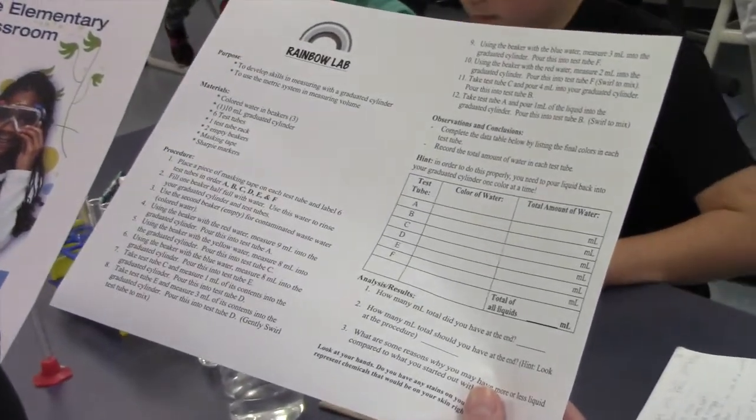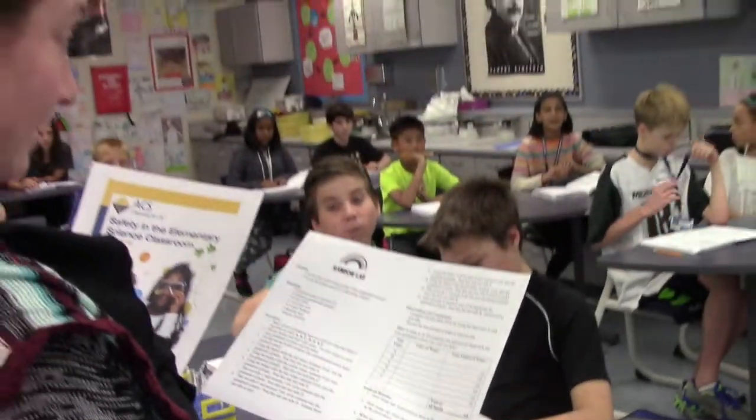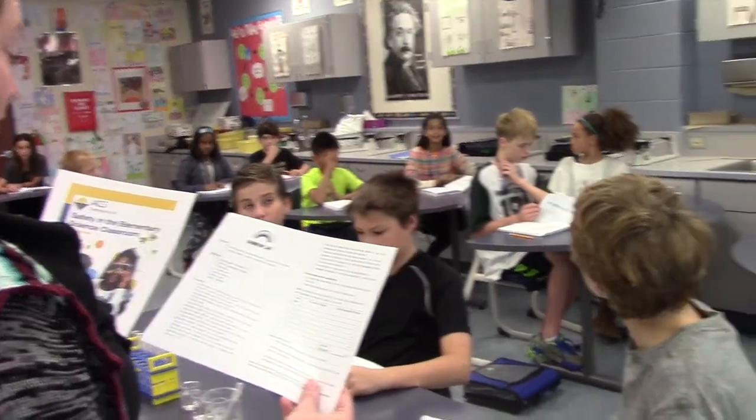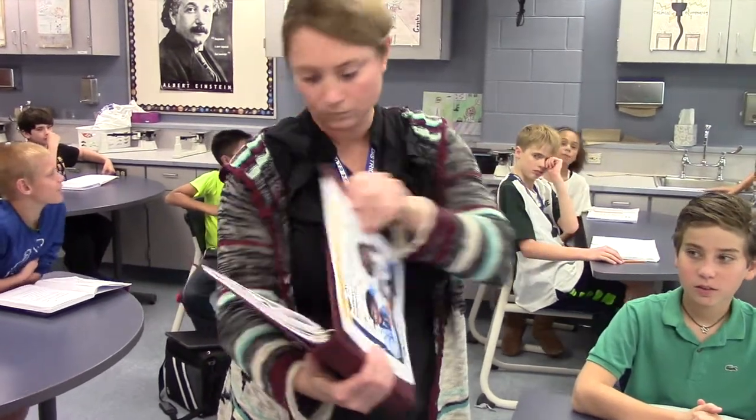Take time to plan. Identify the materials you will need and how you will distribute them to students. Identify safety issues and plan how you will address these with students. Consider how you will instruct students as they conduct the activity. Always consider possible emergencies and plan how you will handle them should they occur.